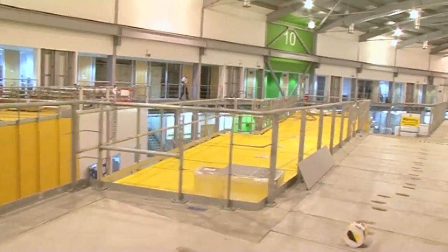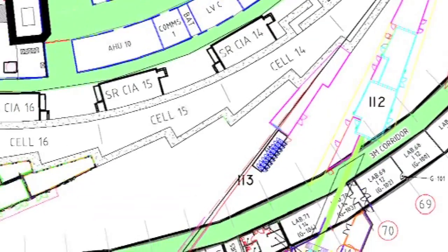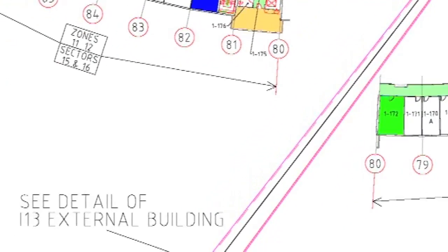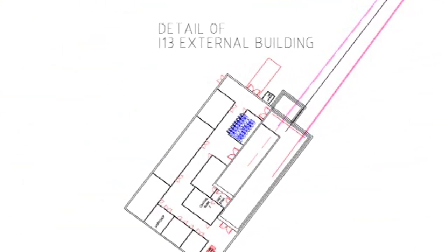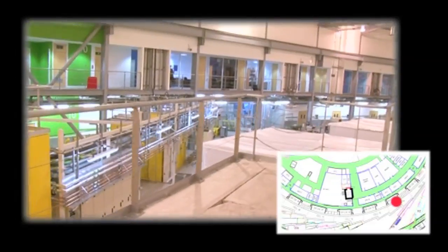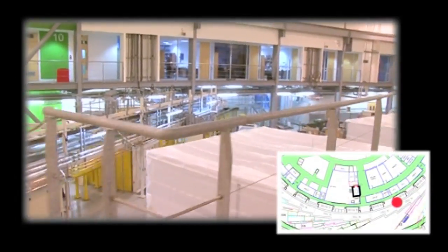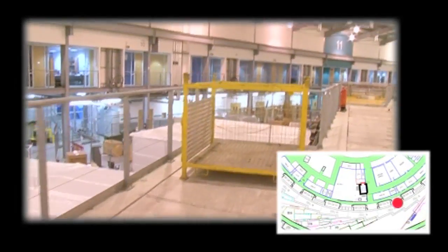I-13 is another of our longest beamlines, going to be 250 metres away from the source, way out to an external building. That's because this beamline does coherence and imaging, and for the properties we need from the beam to perform this technique, we need to be a long way from the synchrotron itself. It's been specifically designed to have ports and a pipe that goes all the way out, with all the experiments taking place in this external building.